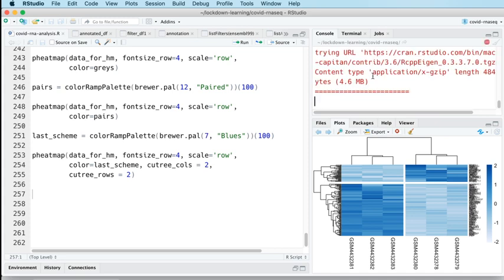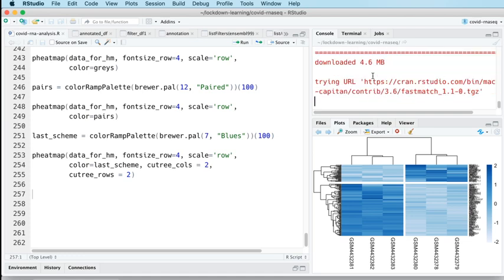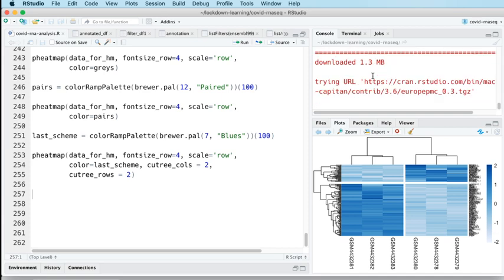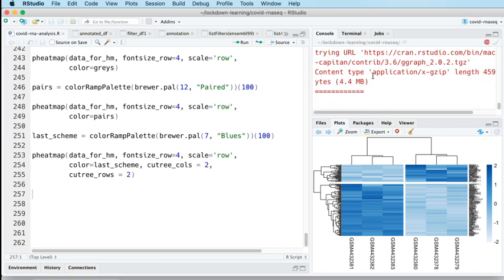The other thing that we need is an annotation database. Having spent yesterday, or the day before yesterday, retrieving annotation data from Biomart, clusterProfiler gets its annotation data in a different way, which is slightly irksome.